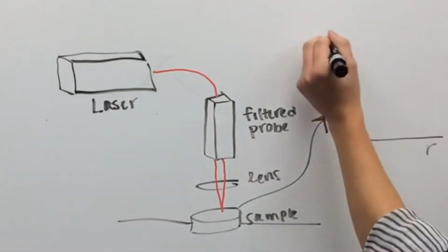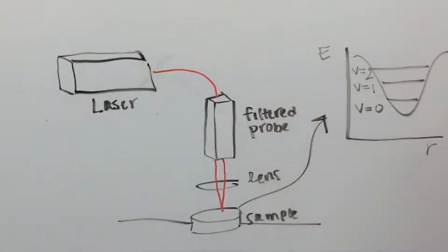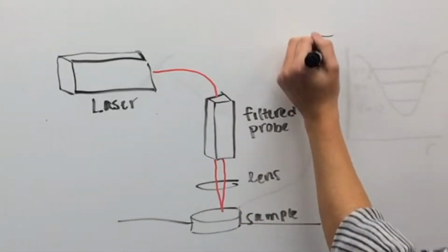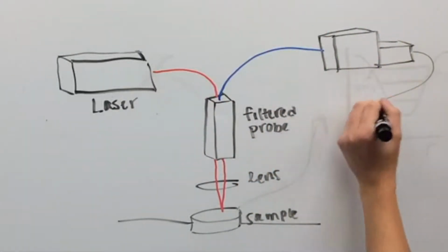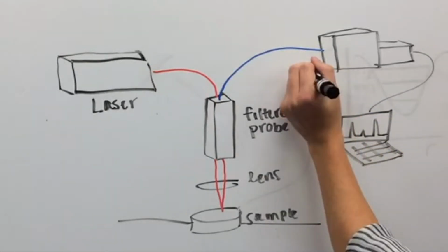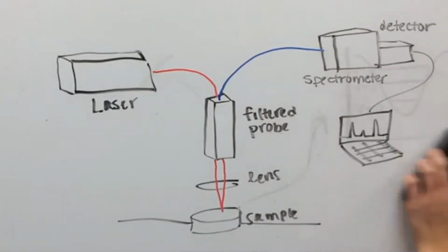Photons are inelastically scattered by molecules within the sample and give up energy corresponding to vibrational levels within the scattered molecule. This lost energy is designated as Stokes. Energy gained is anti-Stokes, but is less intense. Therefore, Stokes energy is used. Scattered photons are detected and analyzed by a very sensitive spectrometer, yielding a spectrum showing energy losses which are characteristic of the molecule with which the photon interacts.